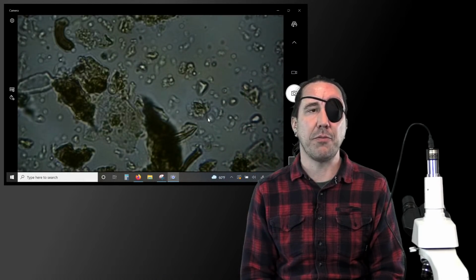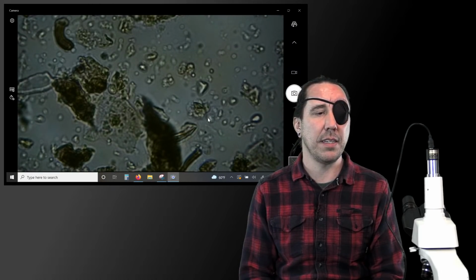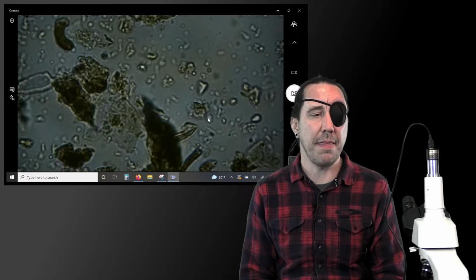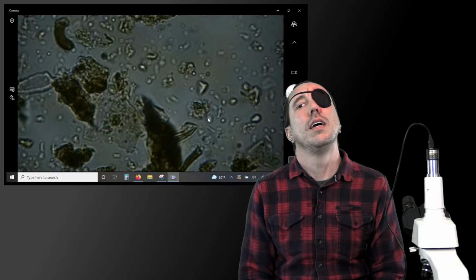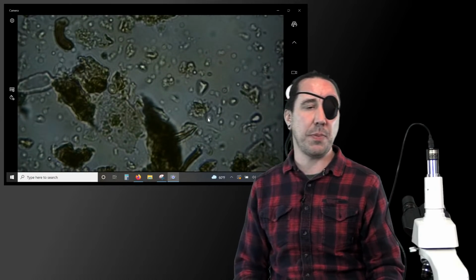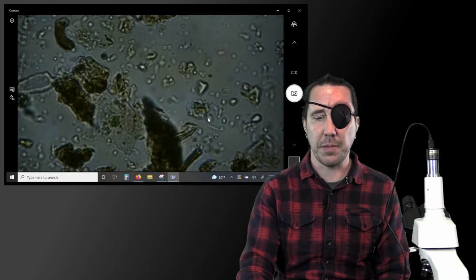But what I was mentioning before was that, like with any other camera, the more pixels you can get, generally the better definition and resolution you're going to have. And oh yeah, you get what you pay for. So it's usually good to spend at least $100 or $150 on a camera. Nowadays I would even say $200 as a minimum to get something that's decent and good.